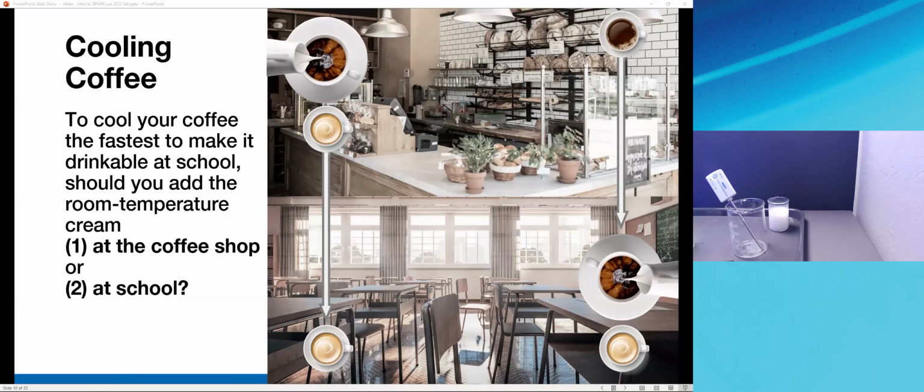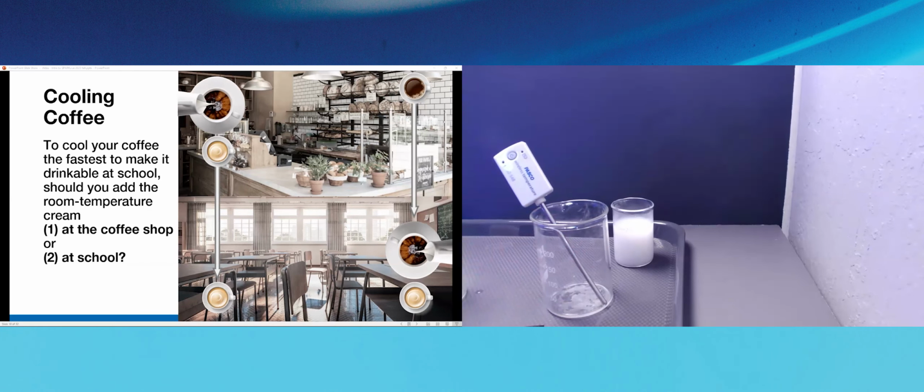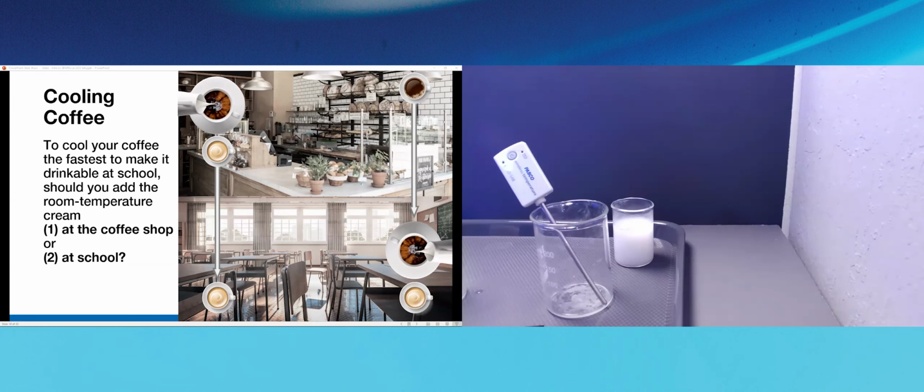All right, leave it open for about 15 more seconds. And by the way, the things you see on the screen here are the cup that we'll use for some hot coffee in a moment, along with the cream. I will be adding cafe au lait proportions of cream here, though. But unlike cafe au lait, it's going to be at room temperature.